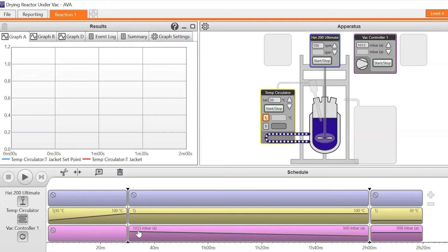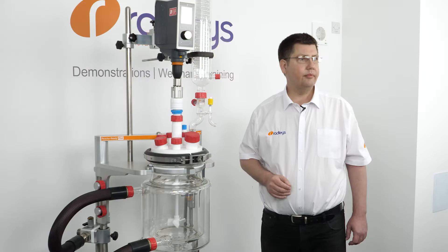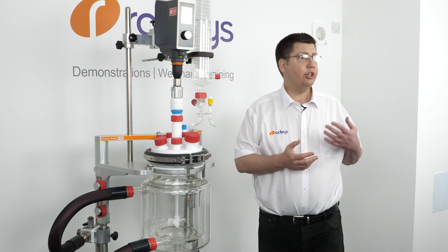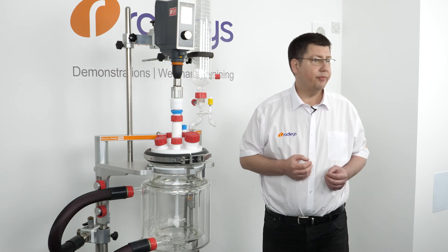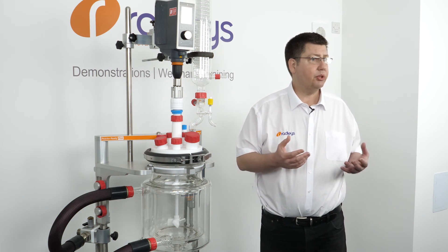After a period of time that can be held until the chemist returns, and now that the reactor is dry, it can be purged with argon or nitrogen. This is usually done using a vacuum manifold or schlank line, a common piece of laboratory apparatus found in most chemistry labs around the world.